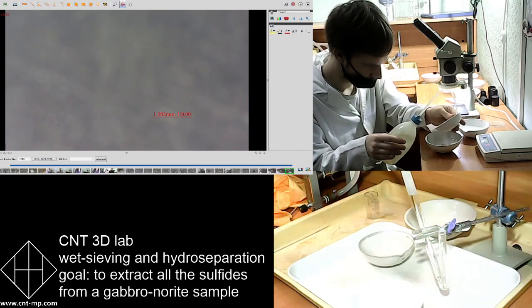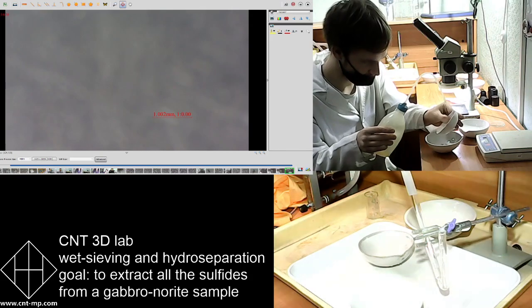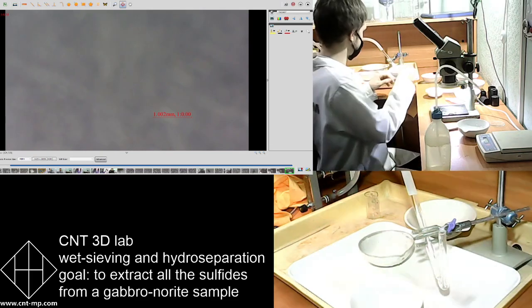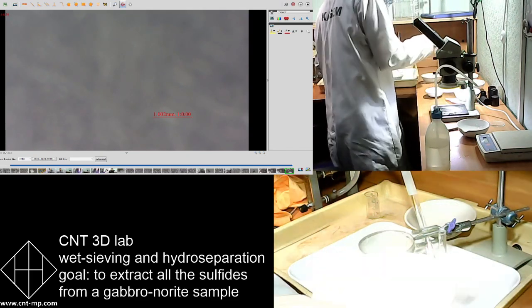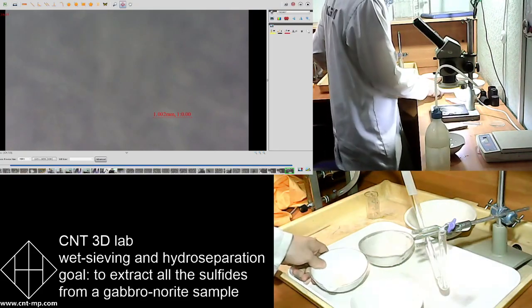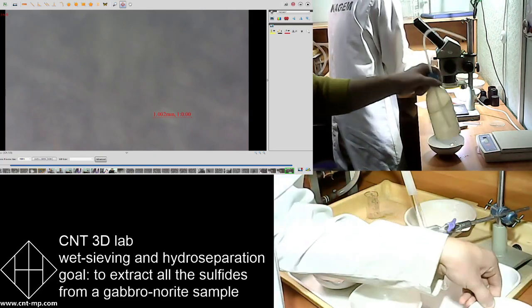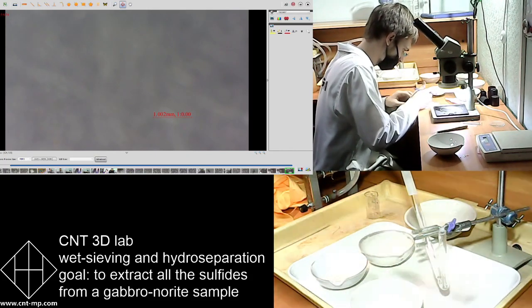Definitely, if we find something in a coarse grain, like if we found sulfides in coarse grain, it should be many more in the finer grain size fraction. It's like with very rare platinum group minerals, they all recover minus 300 microns. You can rarely see larger grains. It's mostly for these late intrusions, it's basic and ultra basic kind of mineralogy. It's always recovery on a very fine grain.